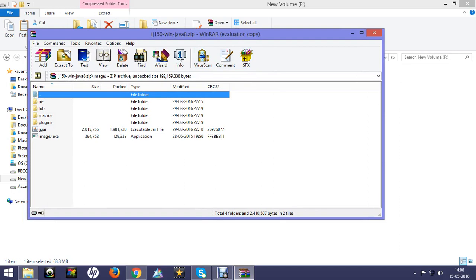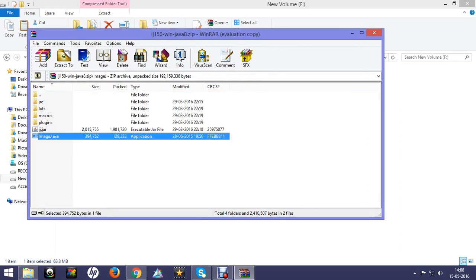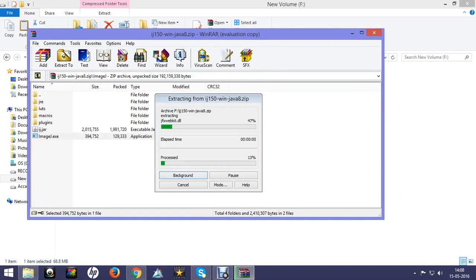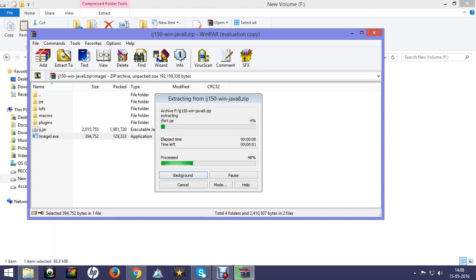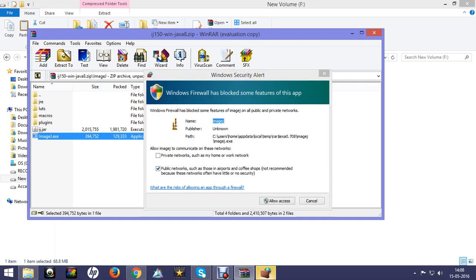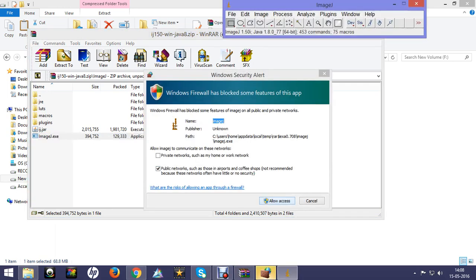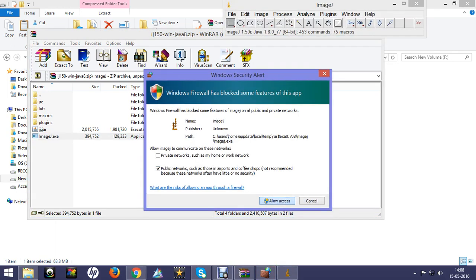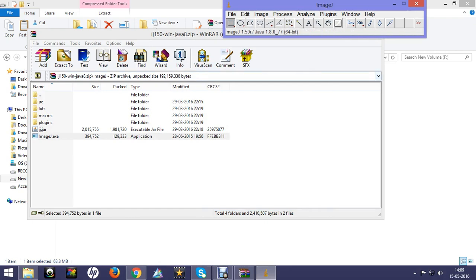Click on that and it will automatically extract that file and install it. After installing, allow its access and ImageJ will be ready.